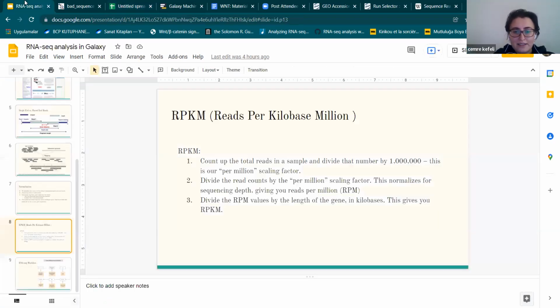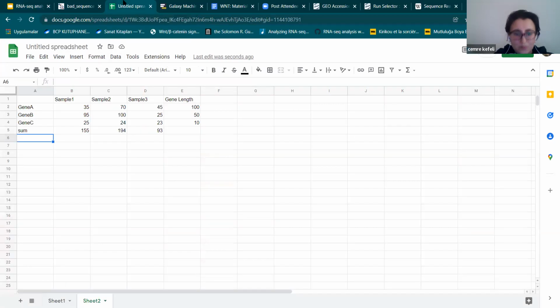Normally in the original one it is million, but the million is an arbitrary number to make the numbers look more understandable. When it's millions, it's kind of crazy, but when it's smaller, we can understand it better. So I will scale.